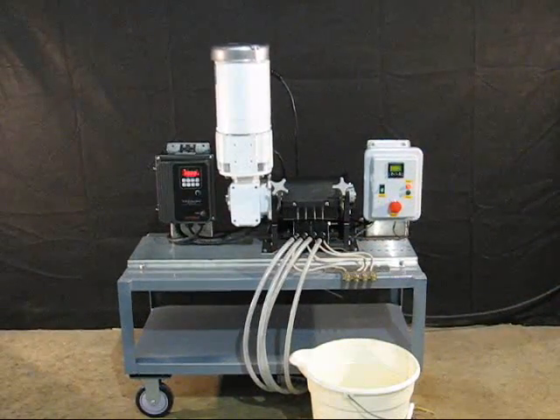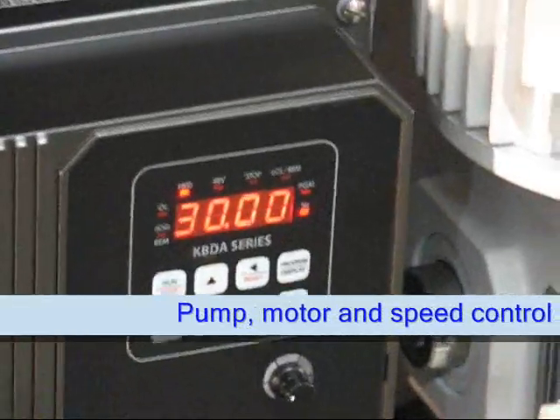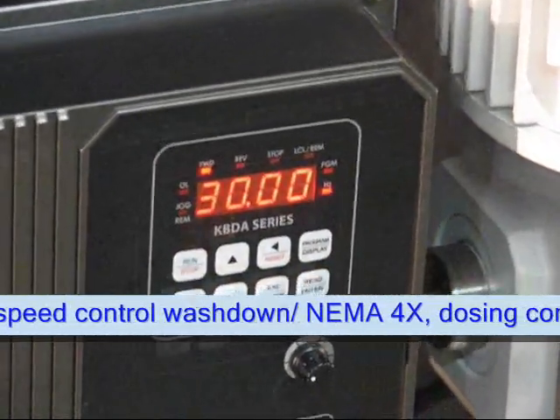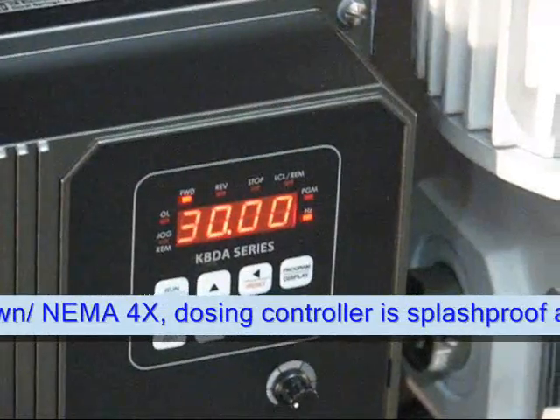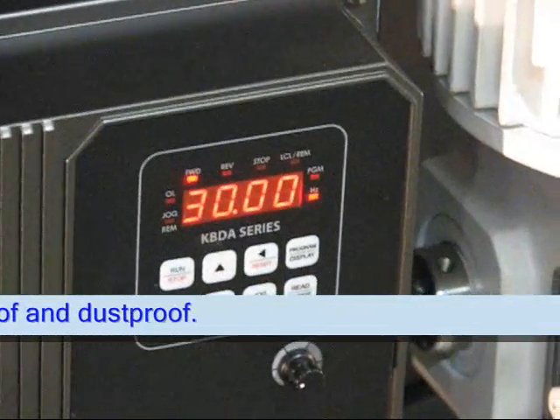The components shown here from left to right include the speed controller. The readout of the speed control shows the actual speed of the pump, which can be adjusted from as few as a few revolutions per minute up to 450 revolutions per minute.